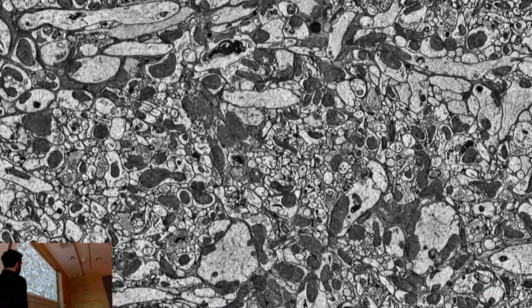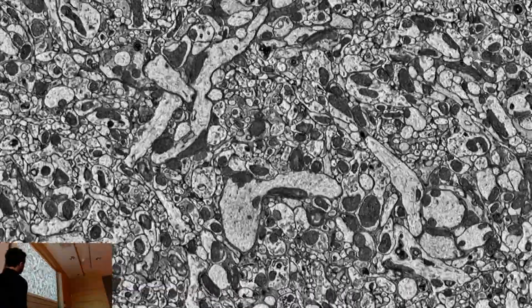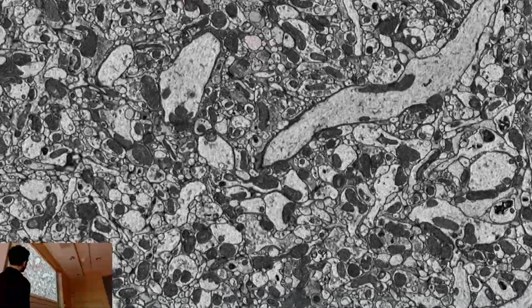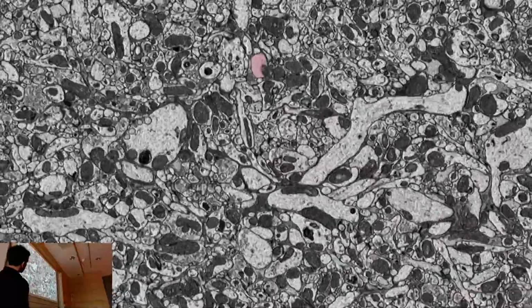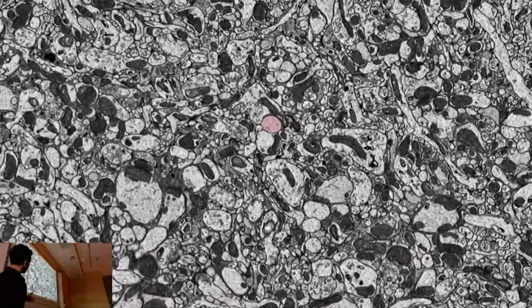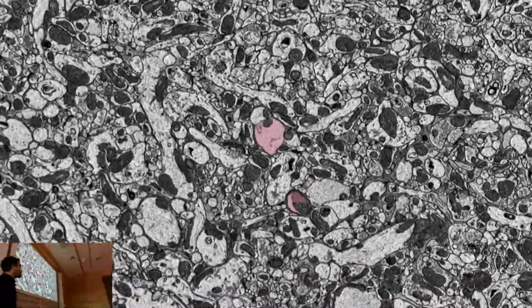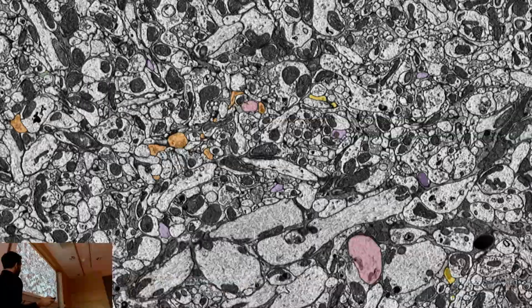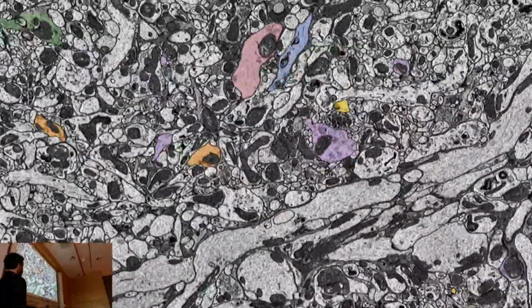And then in the high resolution, we obtain this kind of image stacks. Here we can see different neurons flowing through the z-axis, and we can identify specific individual neurons that flow through it, and we can follow their path, and we can also identify synapses. And then if we do that for many neurons through our volume, we can obtain the full circuit in a region.